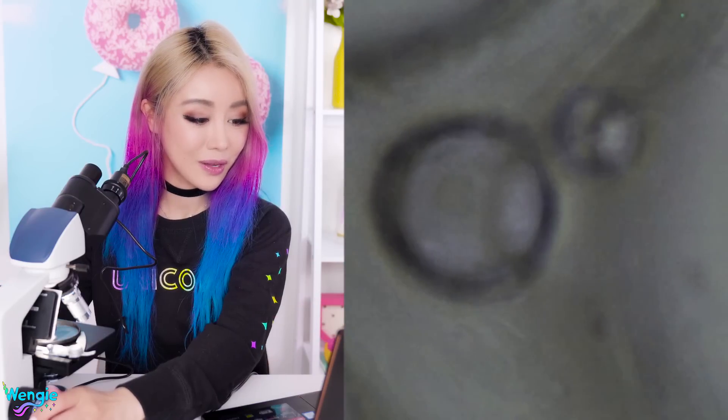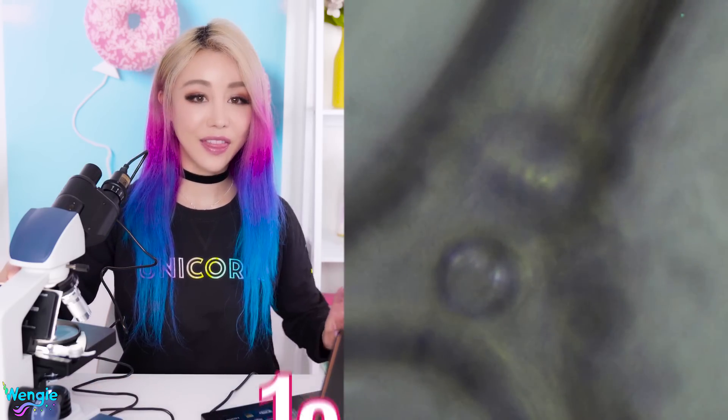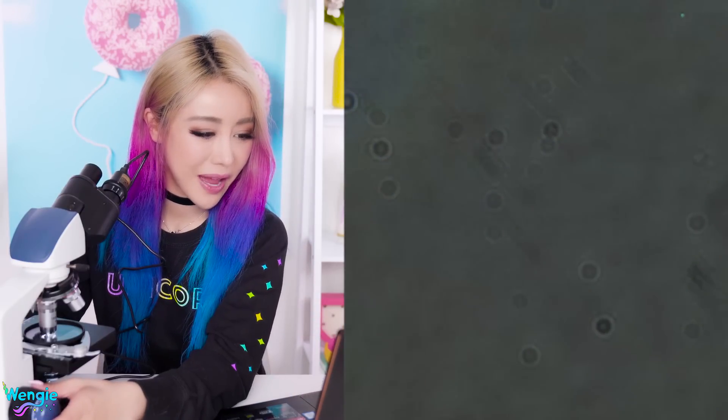There is the little bubble we saw before, now a lot bigger — they look like giant bubbles at 400x. Let's see what this little bubble looks like at 1,000x zoom. We're back to terrifying again. They're no longer circular — we're back to the terrifying holes. So that was shaving foam under a microscope: started off kind of cute and then got kind of ugly.